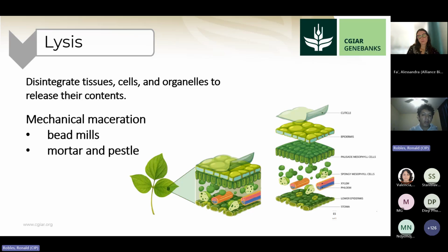In a living organism, the DNA is preserved inside compartments of the cell, and for this reason, our DNA is well preserved and functional. But at the moment in which we make this mechanical maceration, all the compounds of the cell are mixed together, and the DNA is prone to be degraded by the other compounds of the cell. This is the reason why we need to take special care to avoid the degradation of our DNA.